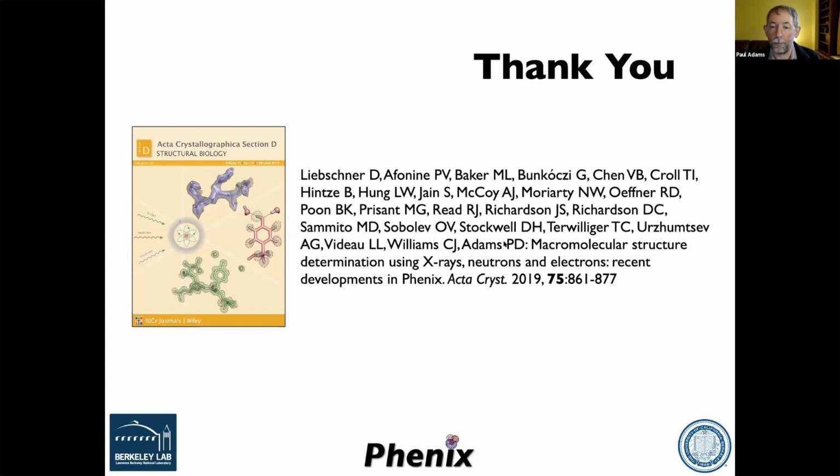Also, the technology is still being developed. The microscopes are still getting better. The detectors are getting better. There are things that are generally improving in terms of technology for the experiments. So it's likely that in general, electron microscopy may move to higher resolution, but I think we still have to see whether that becomes the same as crystallography. That's maybe unlikely, because crystallography selects for things that form ordered crystals. So the experiment itself tends to select for things that are more ordered.